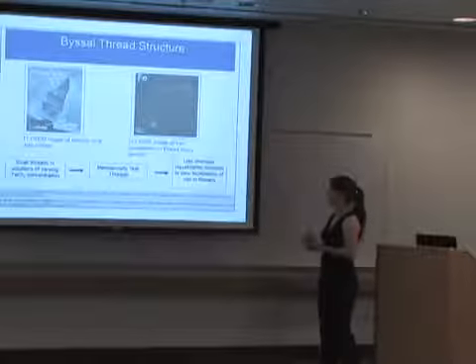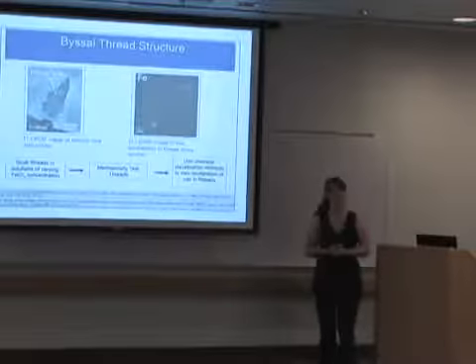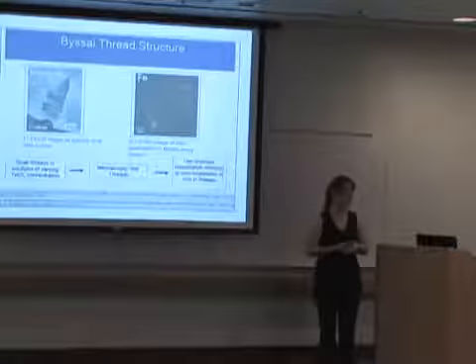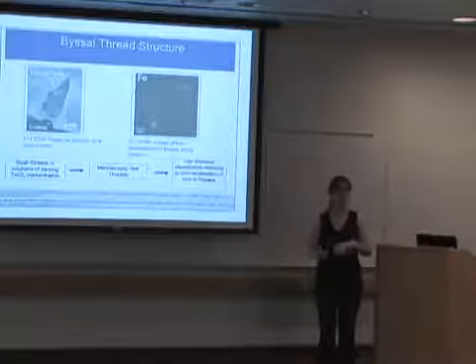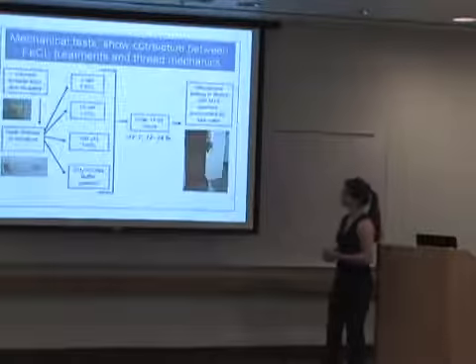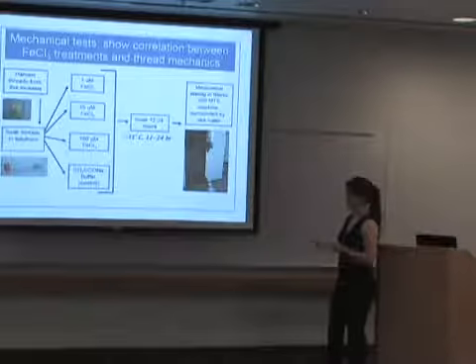And then I hope to eventually use chemical visualization methods to see where the iron's actually going in the thread and to what extent it's being localized in the cuticle or the core as you increase the amount of iron in the thread surroundings. So this is what I did, my setup for the summer.